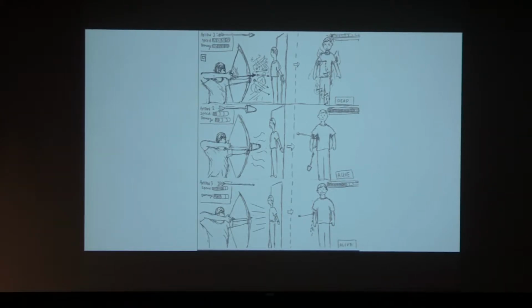However, this picture describes how different forms of silver give different amounts of damage to yeast cells. So we did an experiment on how different types of silver particles damage cells. In our experiment, as he said, we used silver powder, silver nanoparticles, and silver nitrate. Silver powder had the largest particles, but since those particles couldn't enter the cells, they weren't able to deal damage. The silver nanoparticles had medium-sized particles, and they could enter the cell and deal a good amount of damage.